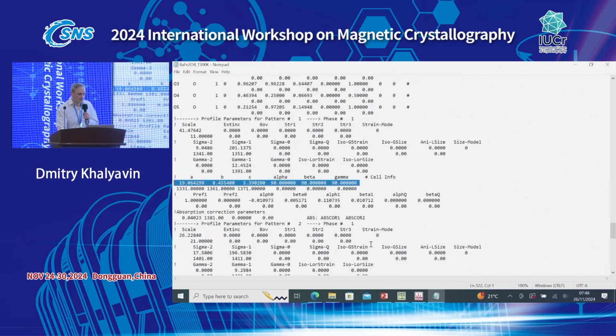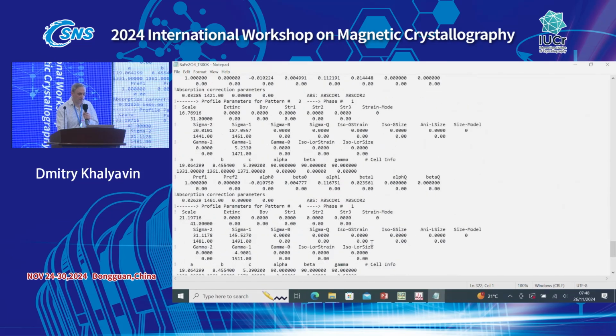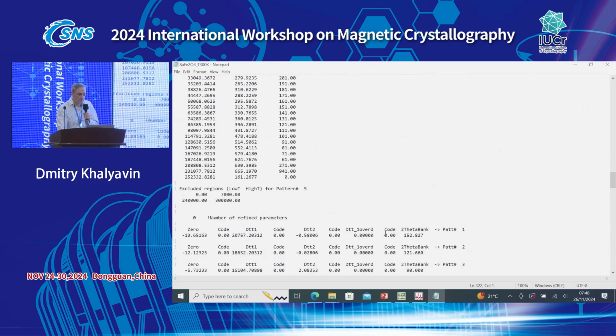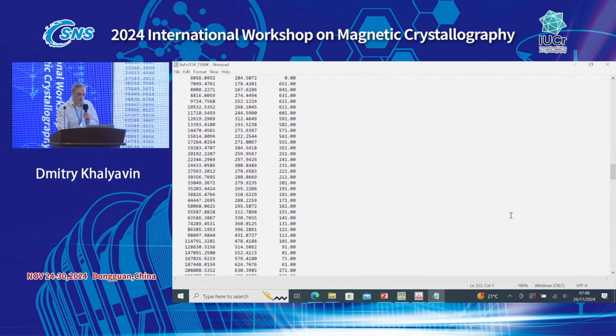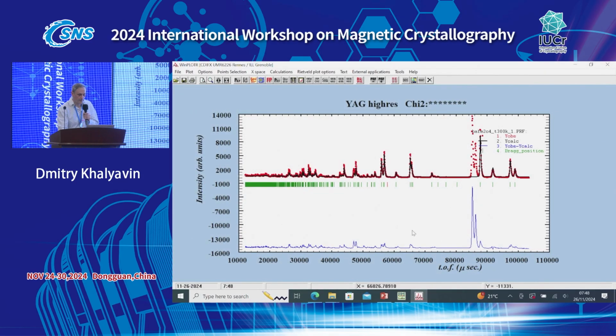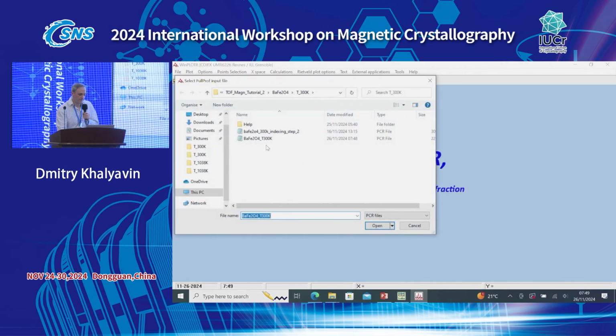Okay, so let's make sure that we haven't made any mistakes. So again, let's just run it and see that the program doesn't complain and just does the job. Okay, so if you are lost, copy and paste the appropriate PCR file from help to the working directory. Okay, let's run.